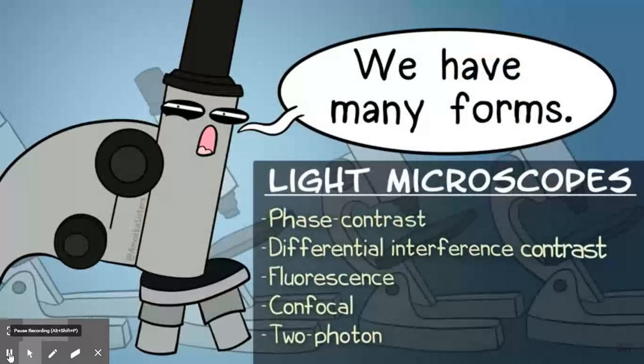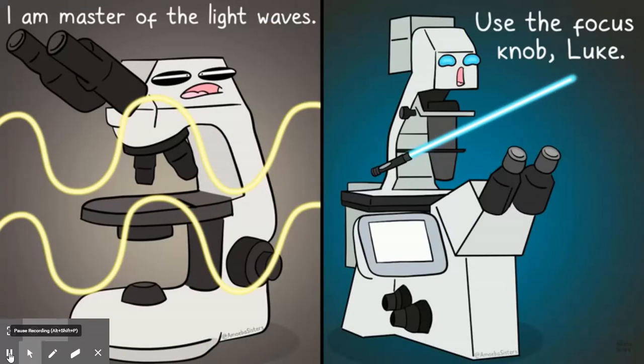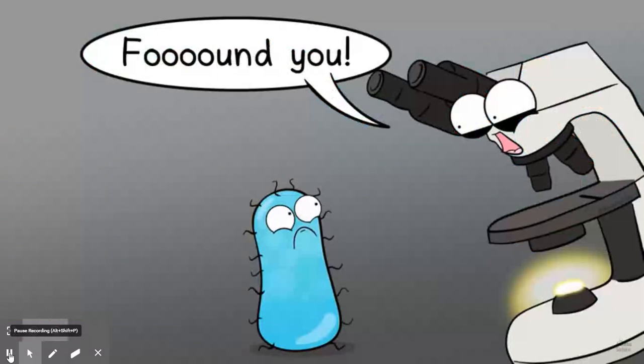There are many other types of light microscopes too. We have a great link for further reading suggestions to learn how each of these work. And some of these are fascinating. Some rely on interference, some rely on using a laser, but the thing to keep in mind is there are certain times when one of these types of light microscopes is more ideal to use than another. So light microscopes use light in some form to see a specimen.